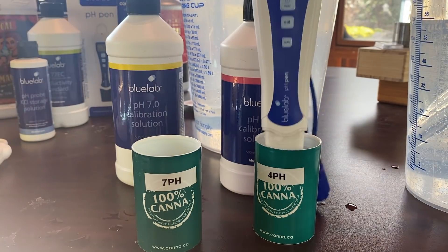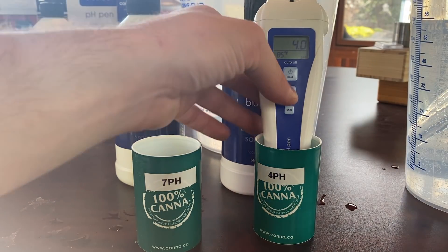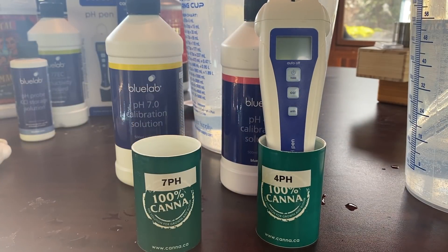You might have to lift it up and put it back in. Now that it's at 4.0, give it a sec, make sure it doesn't fluctuate, and when you're ready, hold the calibrate button and let it do its thing.